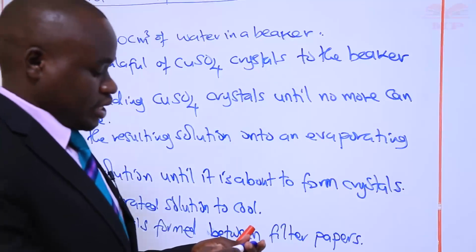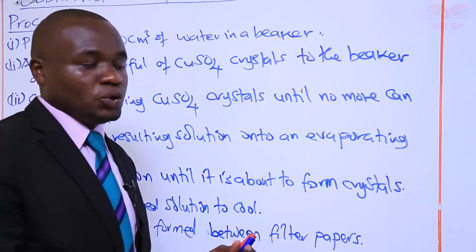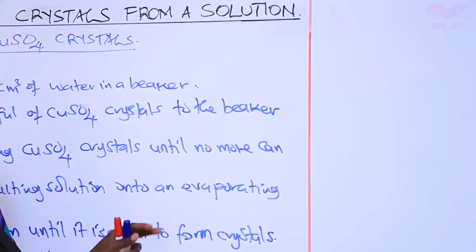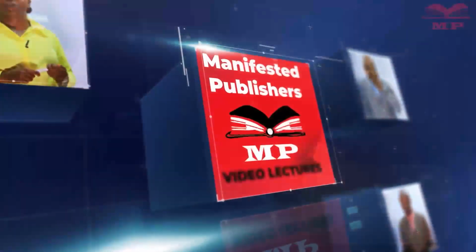So this is how our apparatus will look. So remember, we are heating the saturated solution.